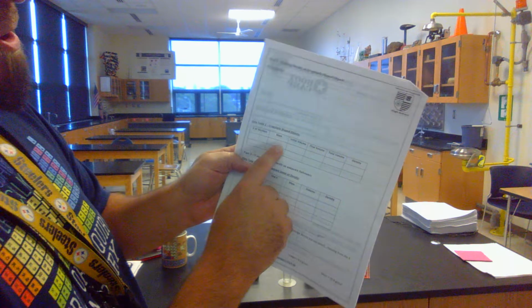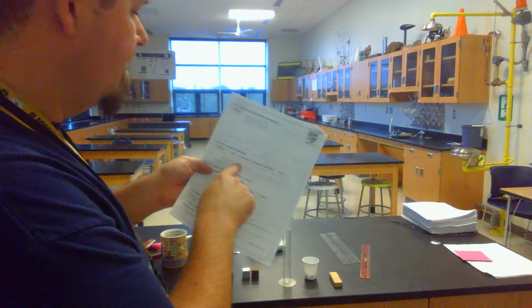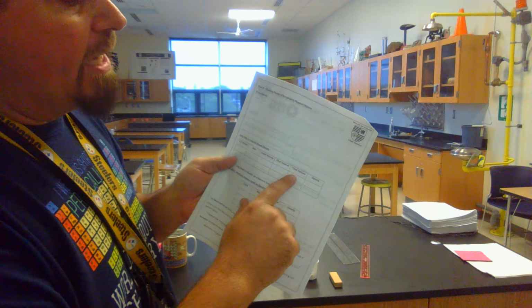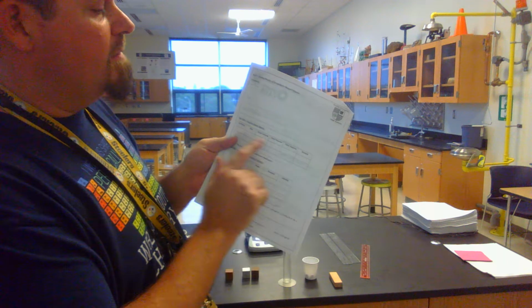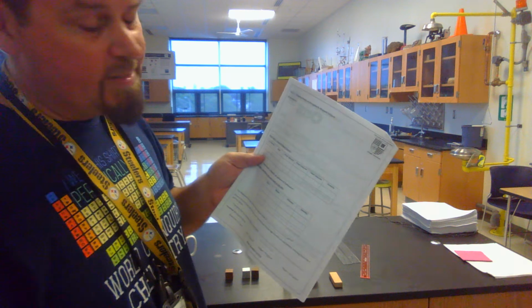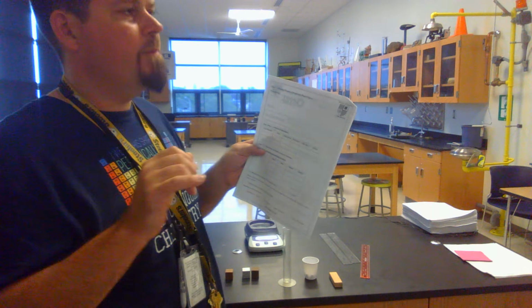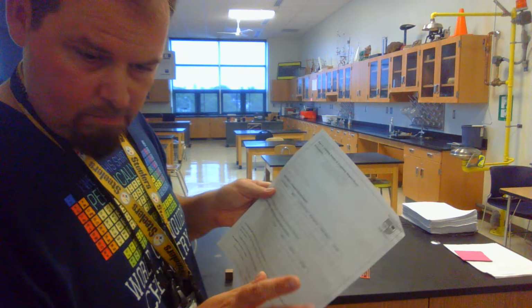Okay. So in there, this column here, you're going to say number of marbles. You're going to mass them. So you're going to put that many marbles on there. Then you're going to do your initial and final volume, and then your total volume. That total volume is actually supposed to be volume of marbles. Okay. Then if you have the volume of the marbles and the mass of the marbles, you can calculate the density. Your 2 densities should be the same. Even though I have, say, 4 marbles here and 8 marbles here, the number of marbles shouldn't change the density of the marbles. Okay? Good? So, with me so far.